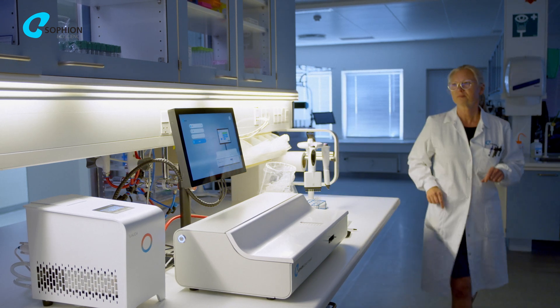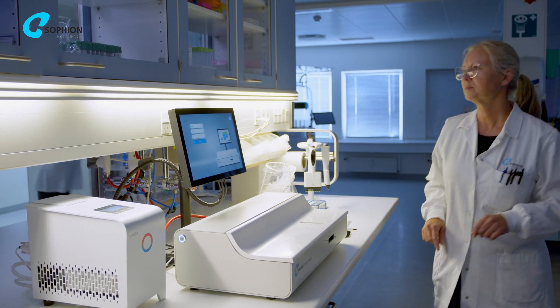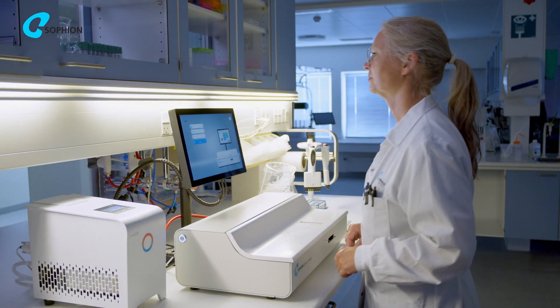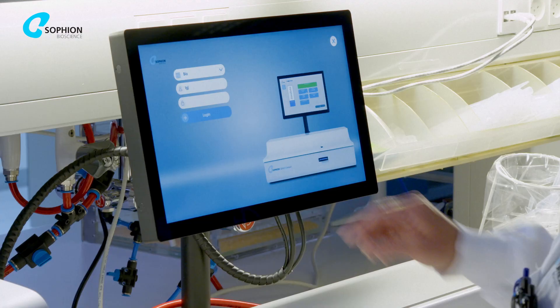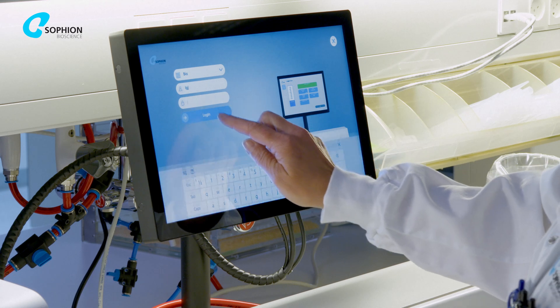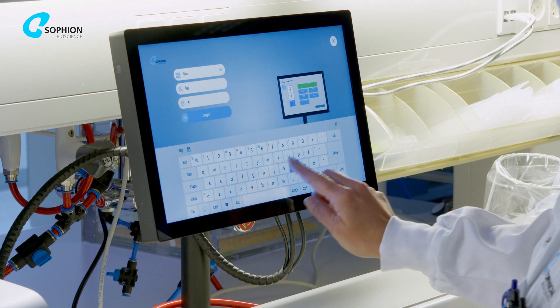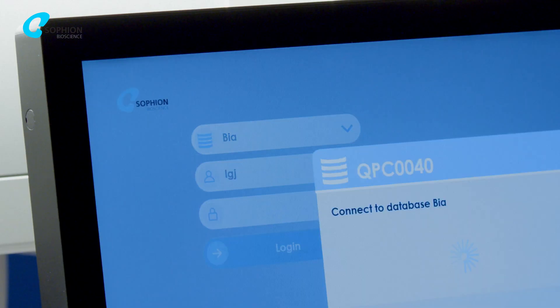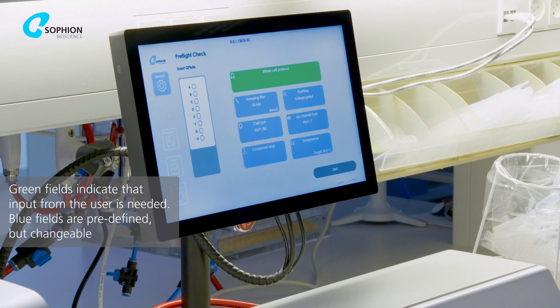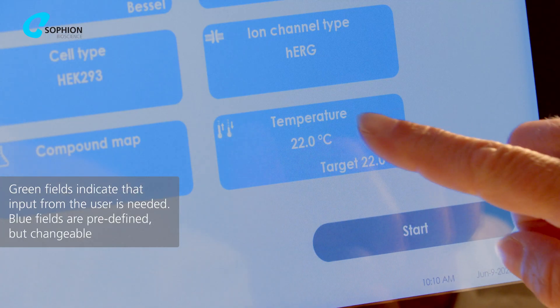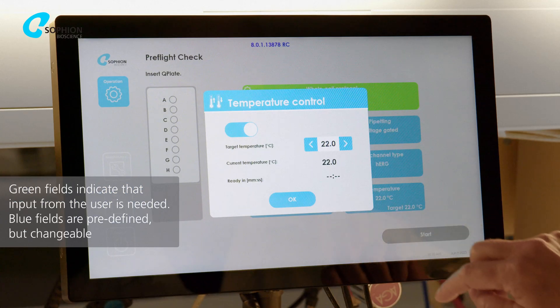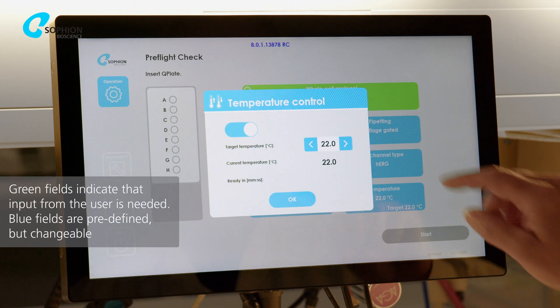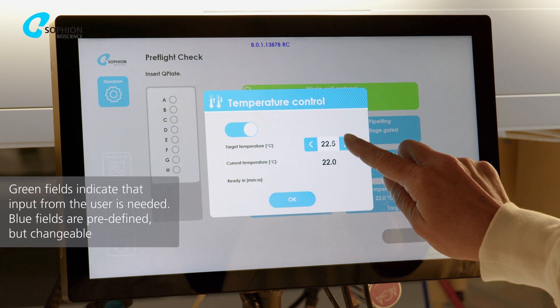To start your patch clamp experiment, first log on to the screening station software. The pre-flight screen appears. Click the temperature control button to define the target temperature for your experiment.